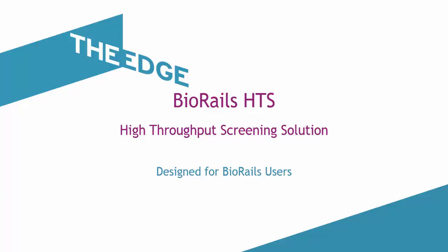Hi, I'm here to introduce BioRails HTS, the Edge's high throughput screening solution to you. BioRails HTS is a high throughput screening tool which automates the process of uploading and analyzing large volumes of data to a BioRails task.